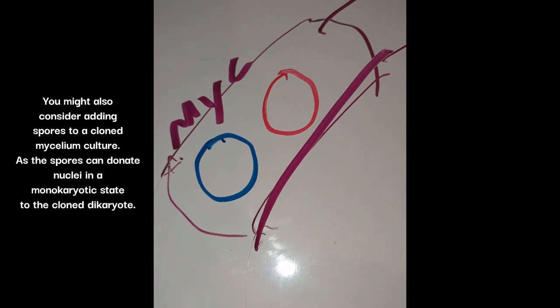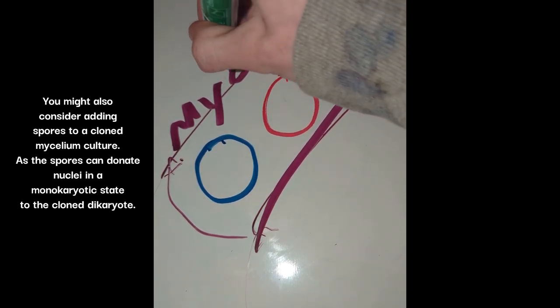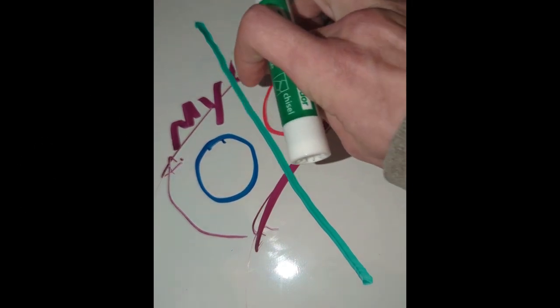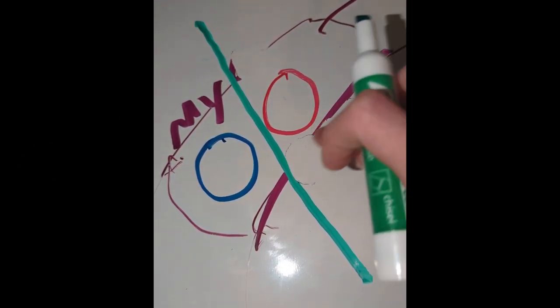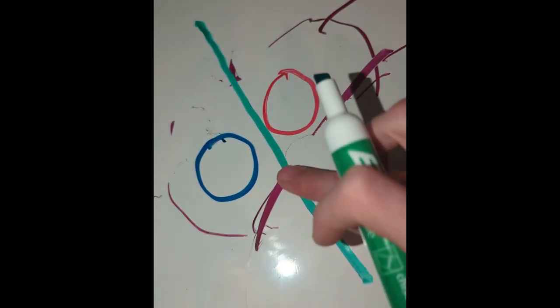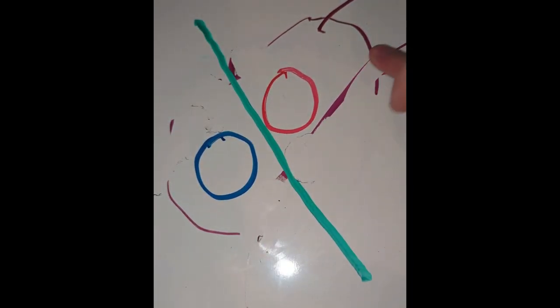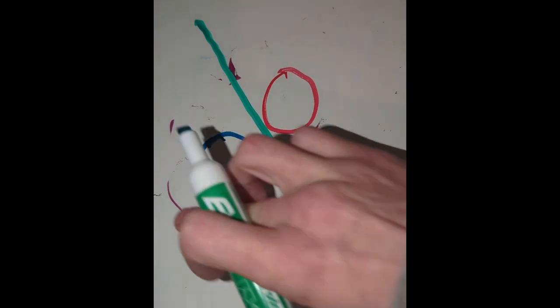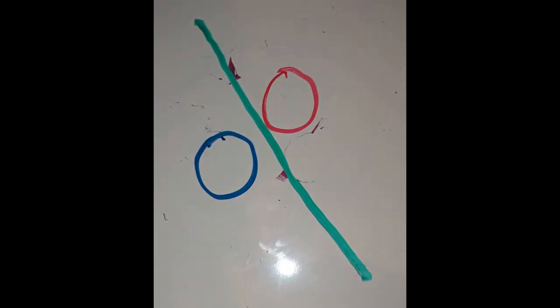And if you're de-dikaryoting, you're going to use a blender to mechanically separate this. And that'll expose the nuclei from the mycelium. So if you had a fruit that was formed off of the 2 parent spores, you can re-expose those nuclei by blending it, simply.